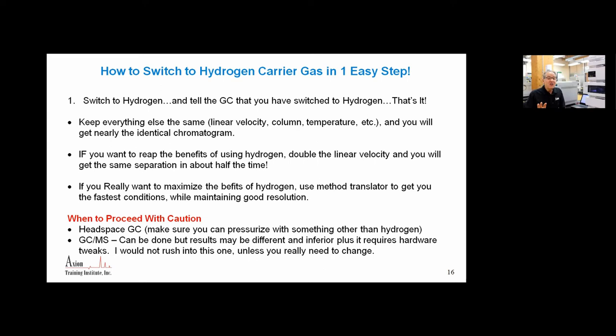When to proceed with caution. This is not a panacea. There are some examples where you do not really want to switch to hydrogen. Let me give you two examples. If you're doing headspace, be careful. Older headspace instruments would pressurize the vial with the carrier gas. If you're using hydrogen carrier gas, you're pressurizing with hydrogen. You made an explosive mixture in an enclosed container. We don't like doing that inside laboratories because it could become a pipe bomb and explode. Most modern headspace autosamplers have the ability to accept a pressurization gas separate than the carrier gas. If you're doing headspace, you must make sure you're pressurizing with nitrogen or helium, and then that you are using hydrogen as carrier gas.